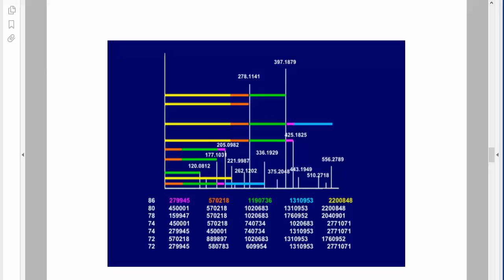I have colored in the subfragments to illustrate how these 5 masses can explain many of the fragment ions. Unlike most mass spectral plots, this one starts at mass 0, so each length is proportional to the weight of the corresponding subfragment.